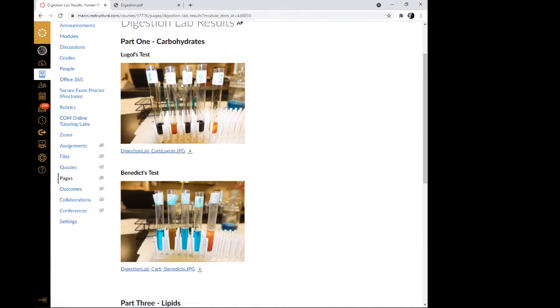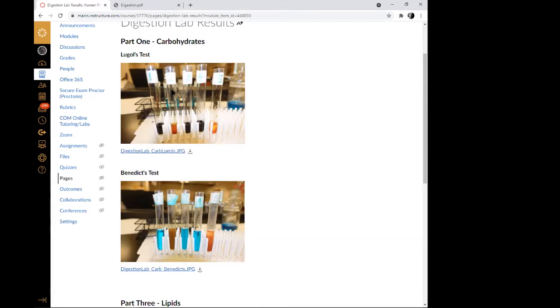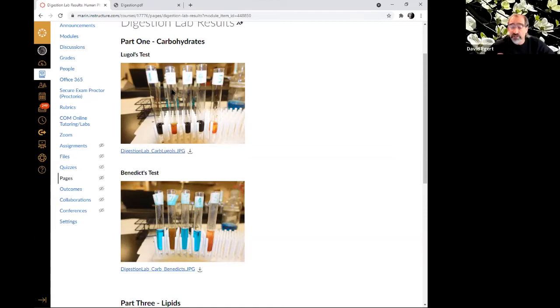You wanted to know whether it's orange or what it means when it's orange? In tube number 2, you see both Lugol's and Benedict's. What do you think happened in terms of starch breakdown and why? Well, I think it broke down because of the amylase and because the pH. No, but I want you to, what's the physical evidence? You had your theory, but I want to say, what does the actual data tell us that we're getting from after doing the experiment?